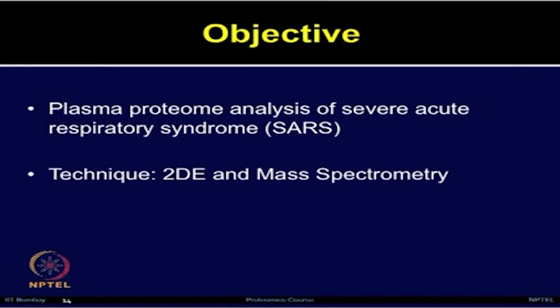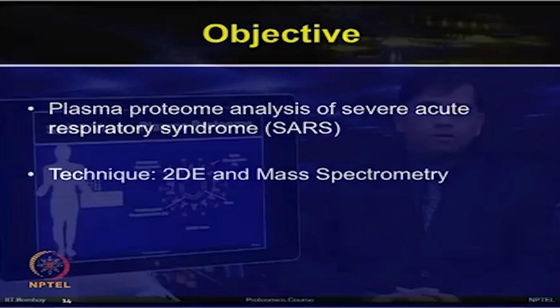In this study, the authors employed conventional two-dimensional electrophoresis, analyzed the images from the treatment with the controls and identified the differentially expressed proteins using mass spectrometry techniques, including MALDI-TOF and LC-MS/MS. Finally, the interesting identified proteins were validated using techniques such as Western blots.